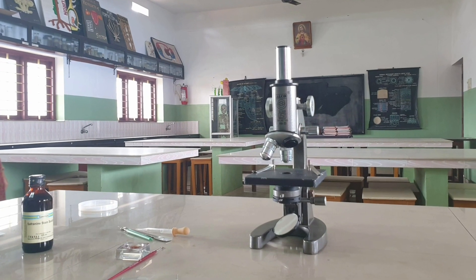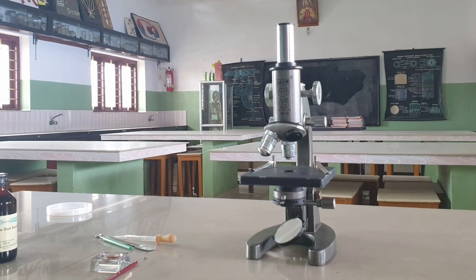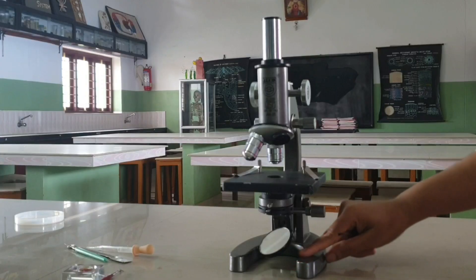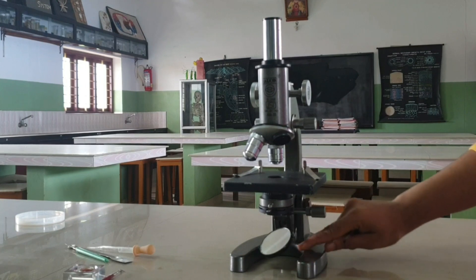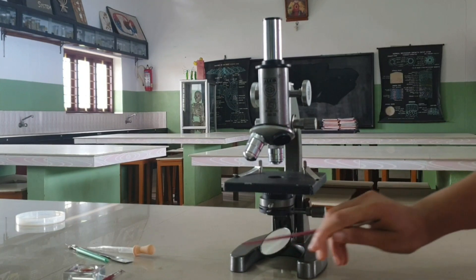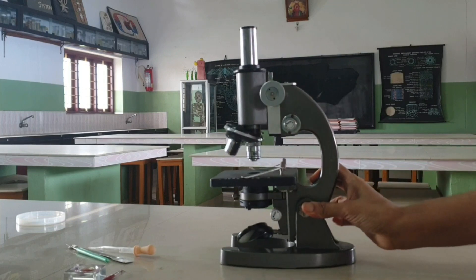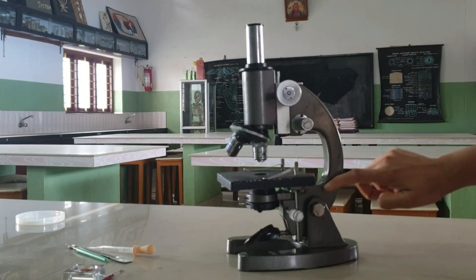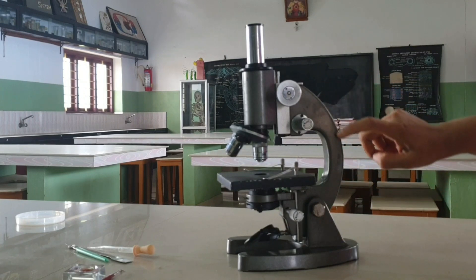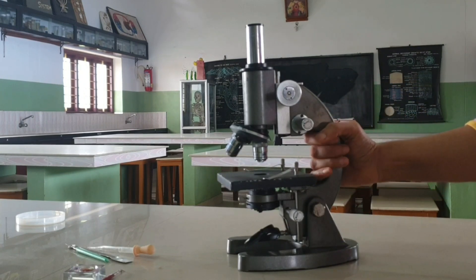A compound microscope has the following parts. Base: it is usually a horse-shoe-shaped structure which provides a stable support for the microscope. Pillar: it is a small vertical projection from the base. Arm: it is usually curved and used for handling the instrument.